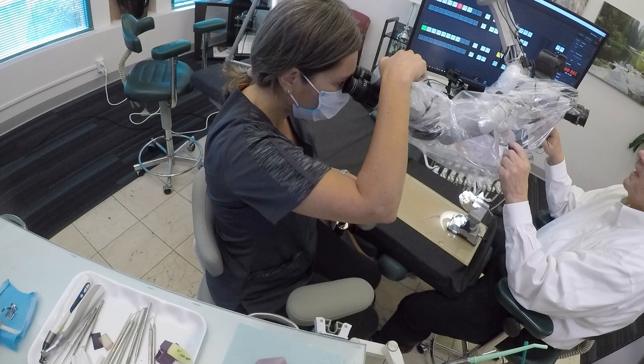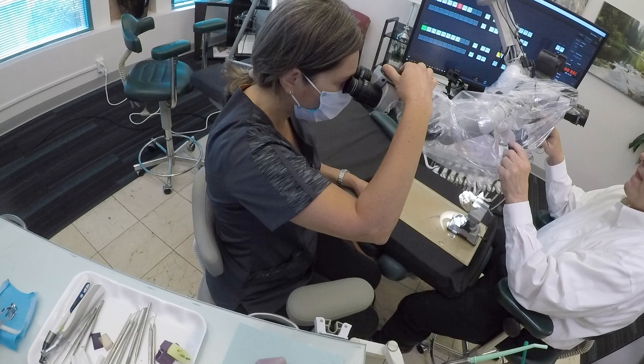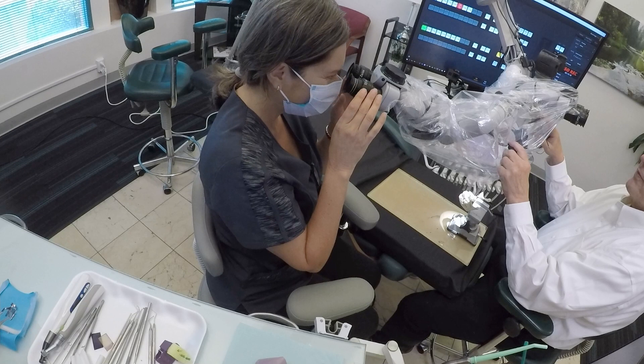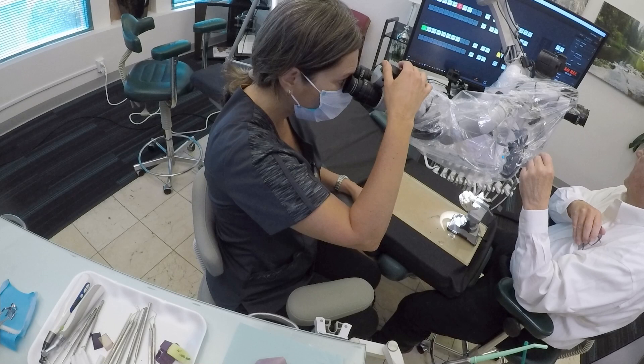Now it's a little bit in focus. Get one image. Make sure we won't go to the next step until you're perfectly comfortable with one image. I have one image, but it's almost like this one side — you have to play with it.